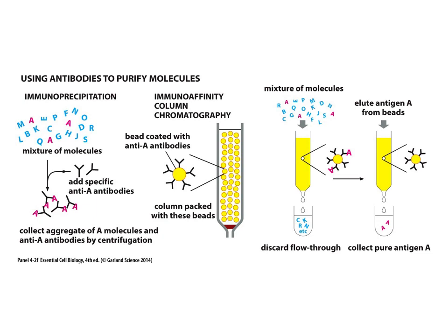So this figure is just showing you the idea of affinity chromatography. We would have antibodies that would be specific to a specific antigen, right? And so these are anti-A antibodies, right? In this mixture here, the molecules would be like a homogenate from our cells. So we've ground up those cells. Maybe we added detergents. Maybe we used the mortar and pestle to create the homogenate.